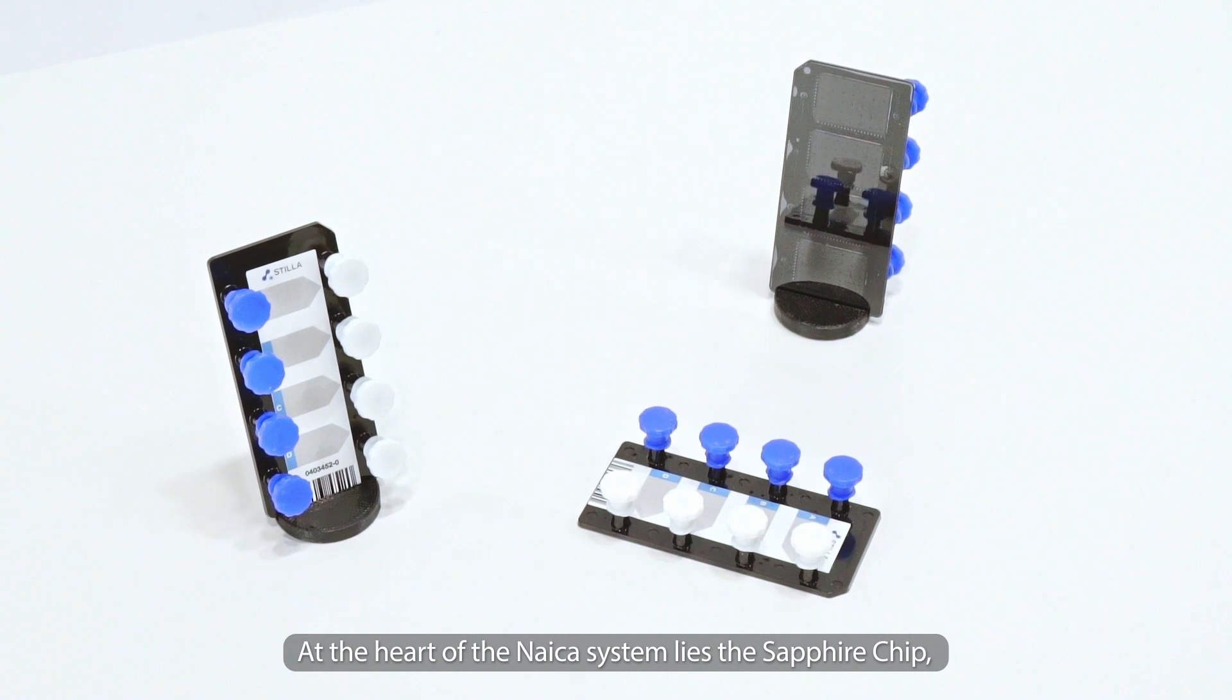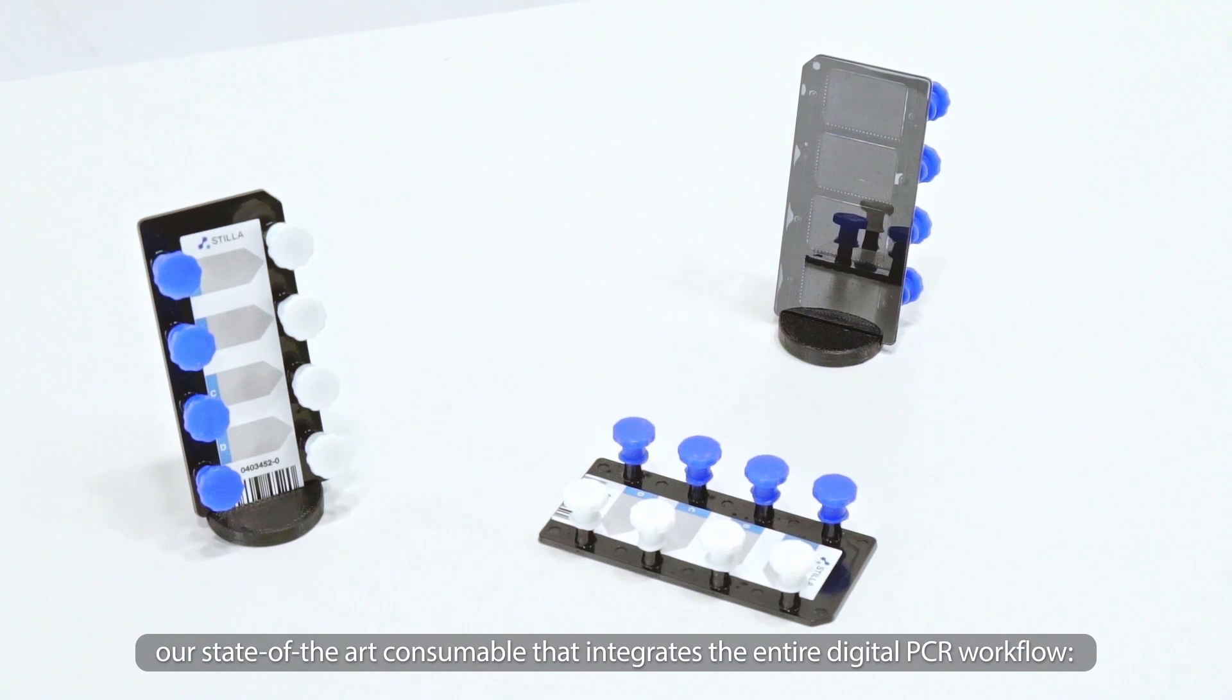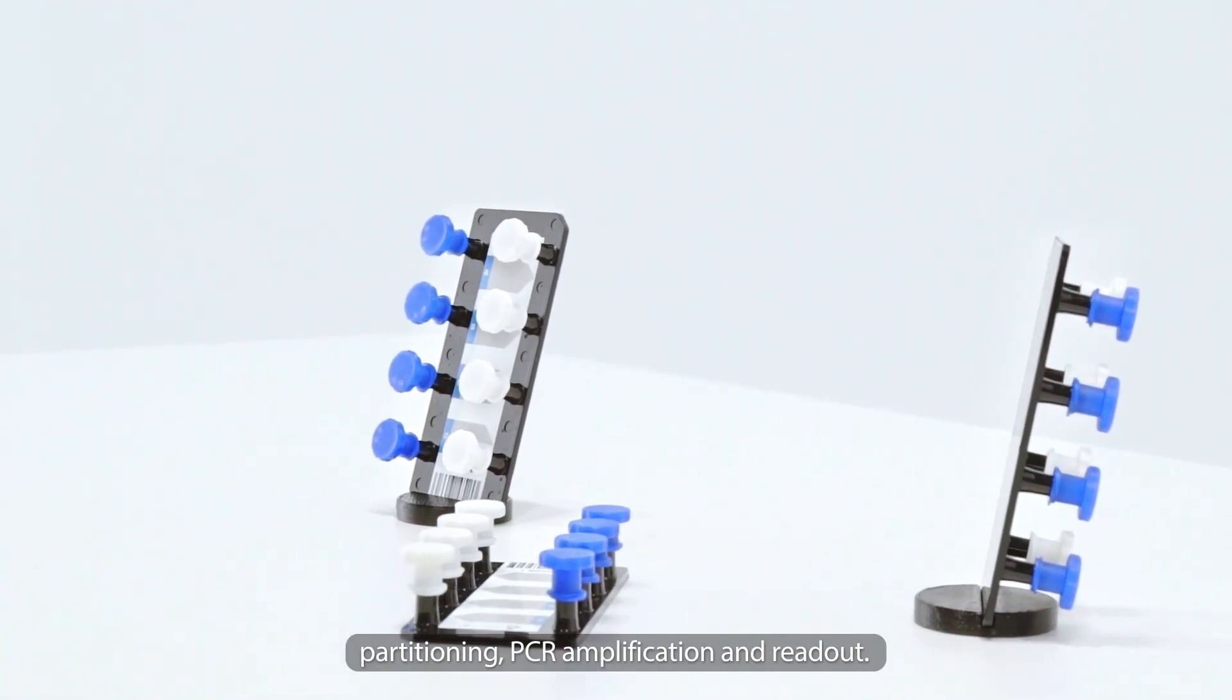At the heart of the Naica system lies the Sapphire chip, our state-of-the-art consumable that integrates the entire digital PCR workflow: partitioning, PCR amplification, and readout.